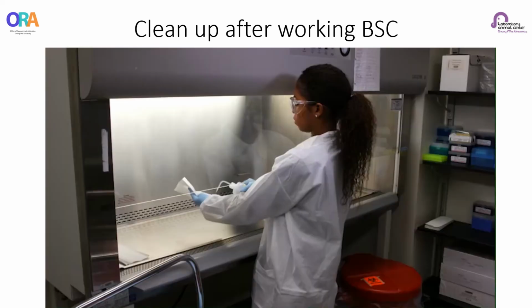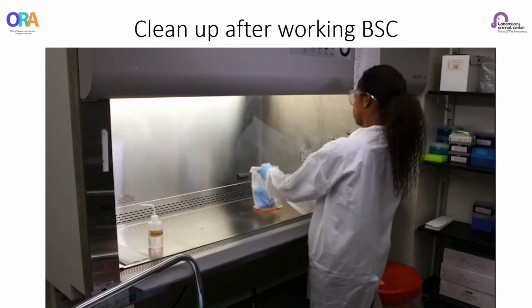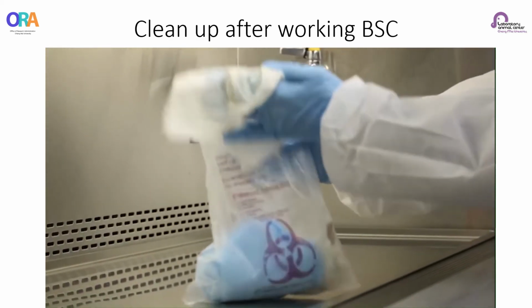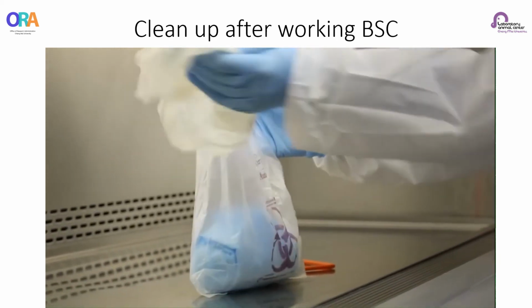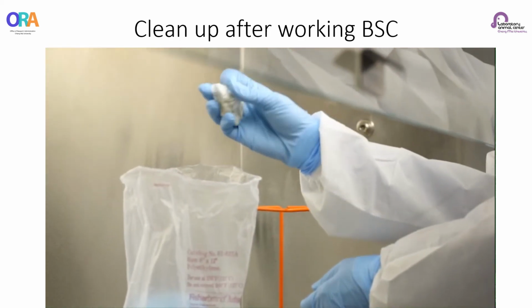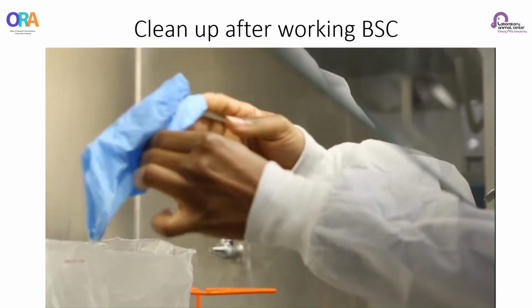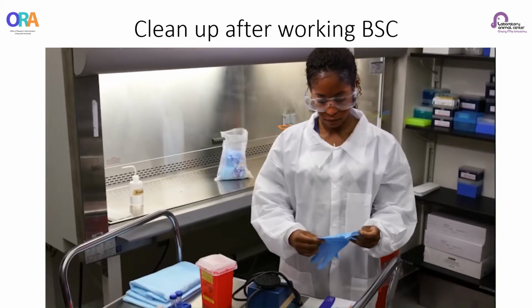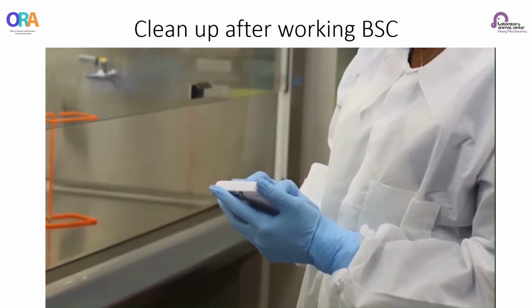To remove the biohazardous waste bag or container, moisten a paper towel with disinfectant and carefully wipe the outside of the bag and/or waste pan. Depending on the type of autoclave, load, and cycle, it may not be necessary to add water to waste bags before autoclaving. Institutional policy will determine specific practices based on validation or verification of the appropriate autoclave operation and performance in your facility. Dispose of the paper towels and gloves, and allow for the appropriate amount of contact time.